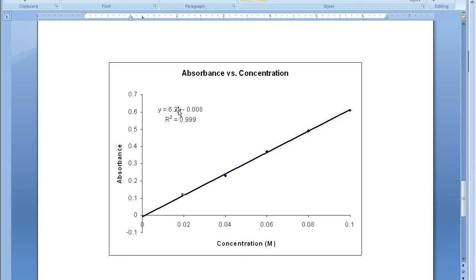That will then allow us to determine how much acetylsalicylic acid or aspirin is present in the solution as well, thus giving us the purity of our sample.